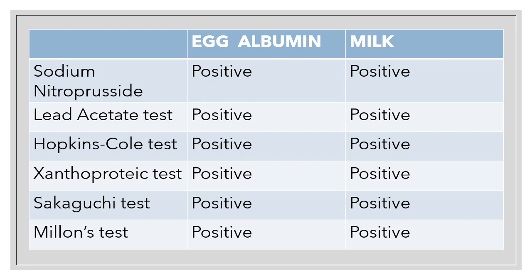Moving on, nitric acid stains are challenging to remove by simply washing, because nitric acid is a strong oxidizing agent and it can cause chemical changes in the substances it comes into contact with. Nitric acid is a corrosive and reactive chemical that can oxidize, degrade, or even modify the structure of materials, including your fabrics and your surfaces, even your skin. It can burn your skin.